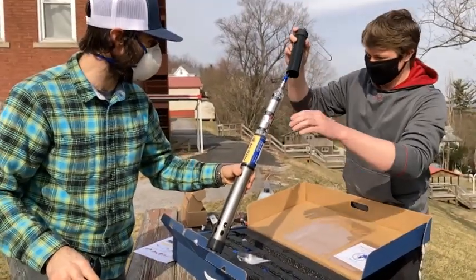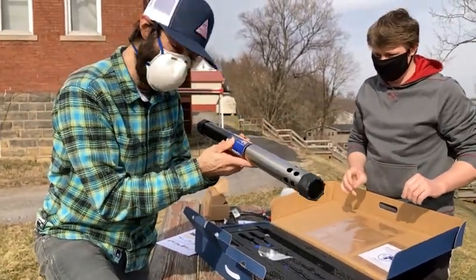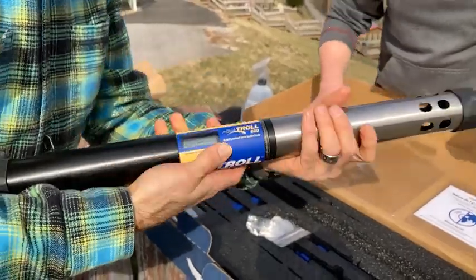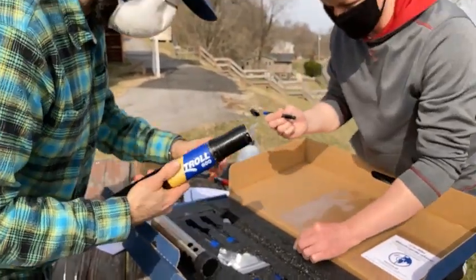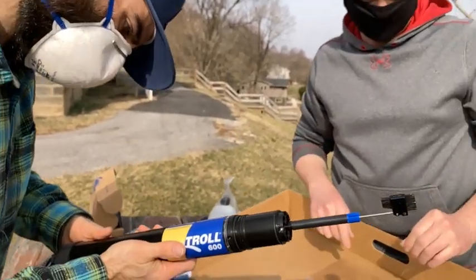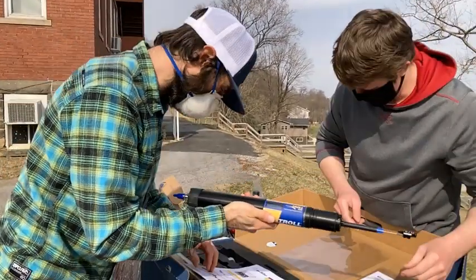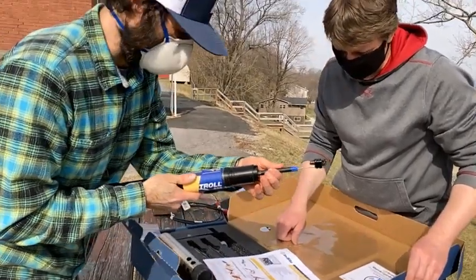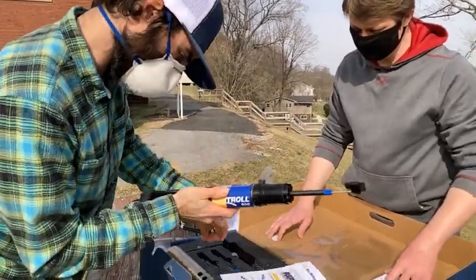Let's close that battery cover — oh, that is smooth! It's actually walking us through setup: install the wiper. There it is. It's beeping at me — install wiper. Okay, apparently we didn't install the wiper quite enough. Taking another look at the startup guide — install dust cap to the wiper loader, plug center port, done. Just needed a little bit more persuasion. Install all sensors.